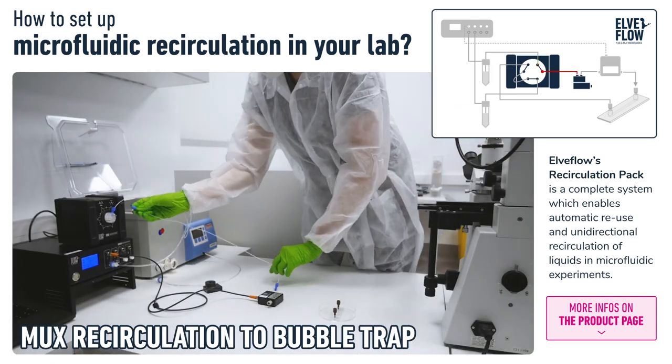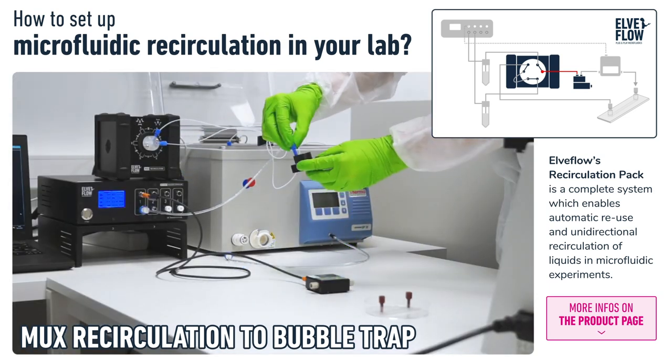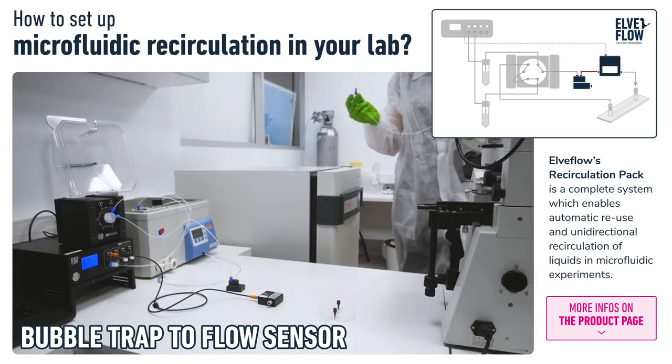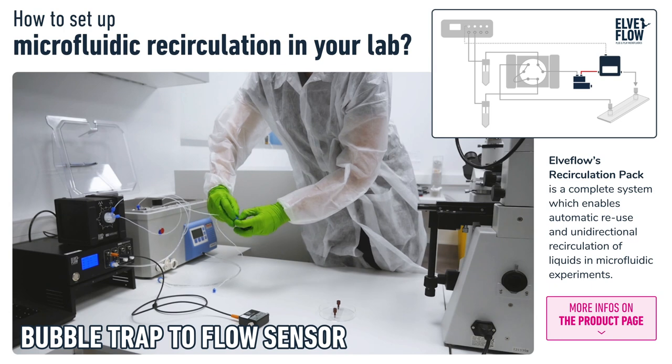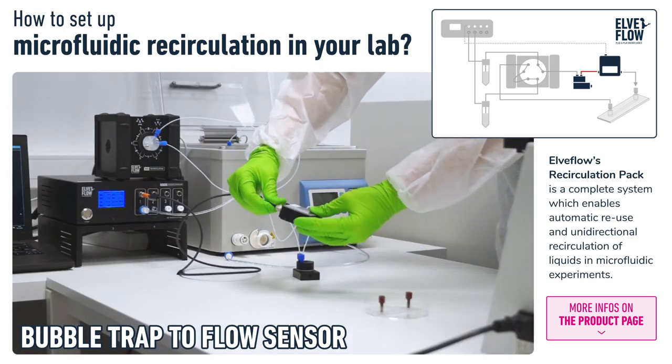Then we connect the mux recirculation to a bubble trap. A bubble trap removes air bubbles from the liquid as it flows through. Then we connect the bubble trap to the flow sensor, which is used to monitor and control the flow rate.